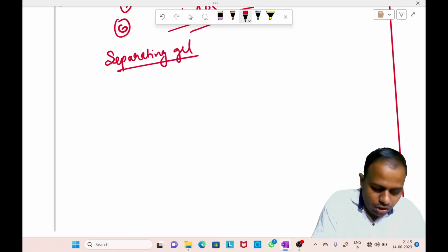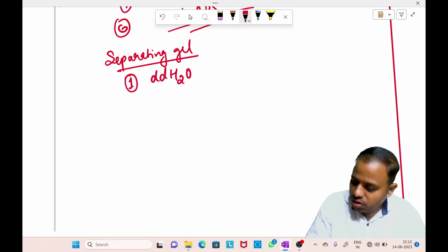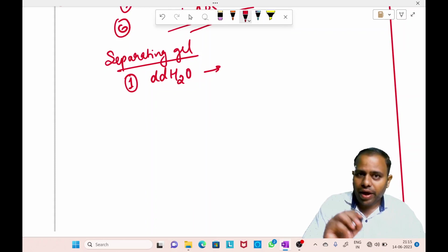Okay, so I'm giving you the standard type of gel. You can vary this depending on the protein that we are separating. Remember, I'm giving you a whole 100 ml gel. Out of that we have 25 ml stacking gel and 75 ml separating gel.